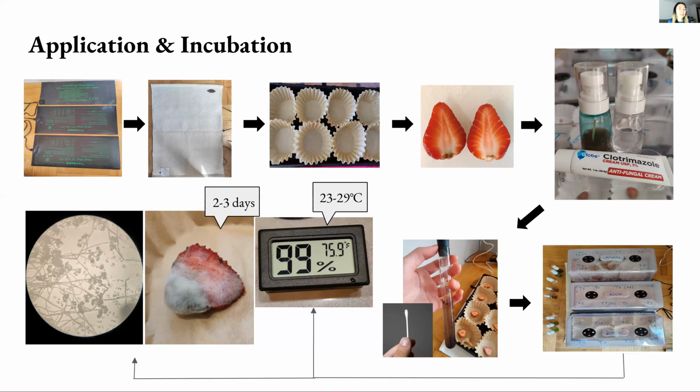Then I sprayed 10 times, which is about 1 milliliter, with each respective solution. Because each pan fitted 8 coffee filters, I was able to test 2 different solutions 3 times in one dome, and use the 2 filters left for positive and negative control.